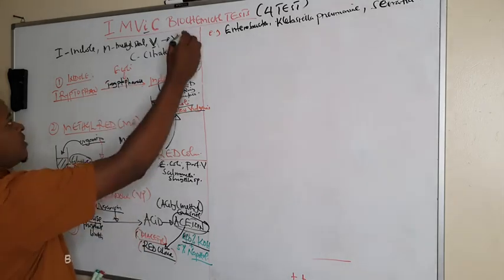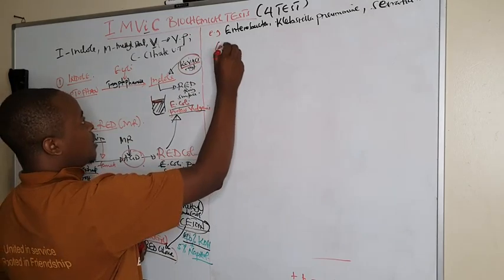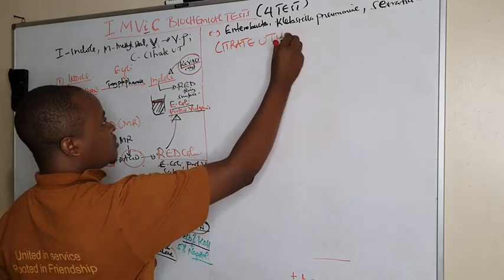Then lastly among the four is the citrate utilization test.